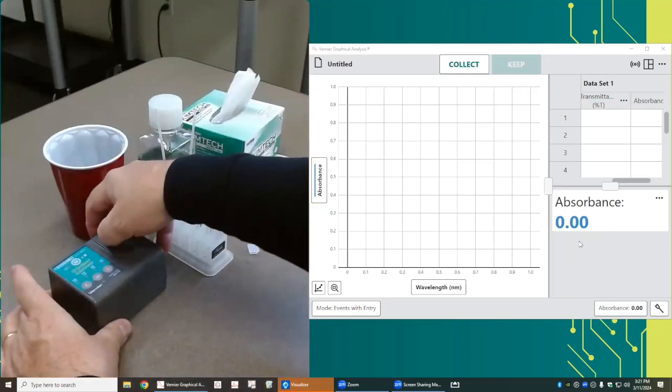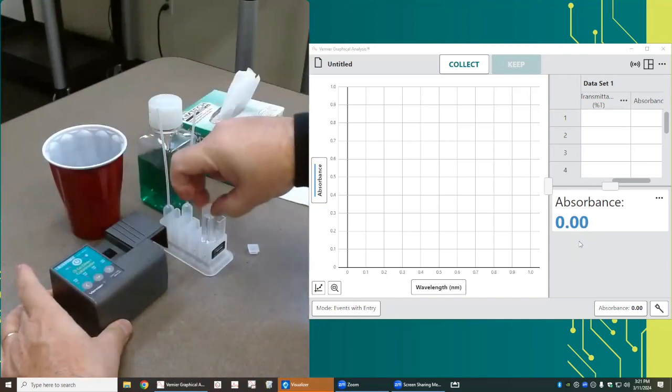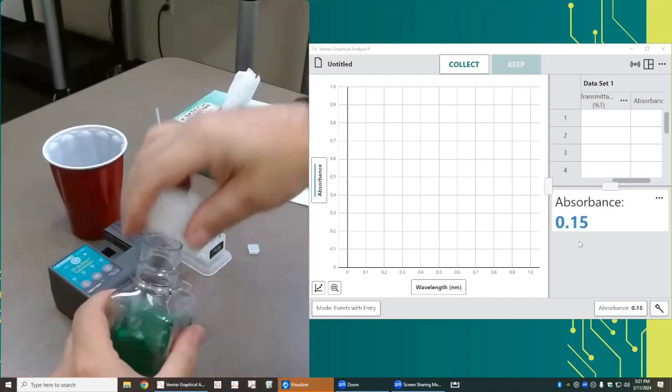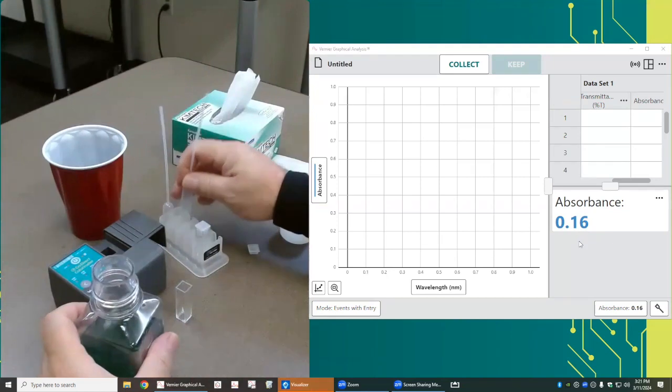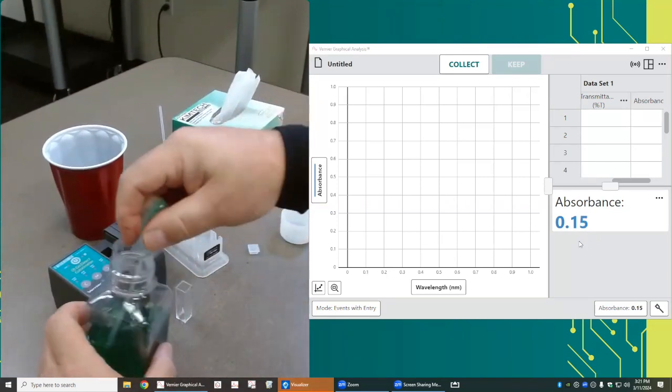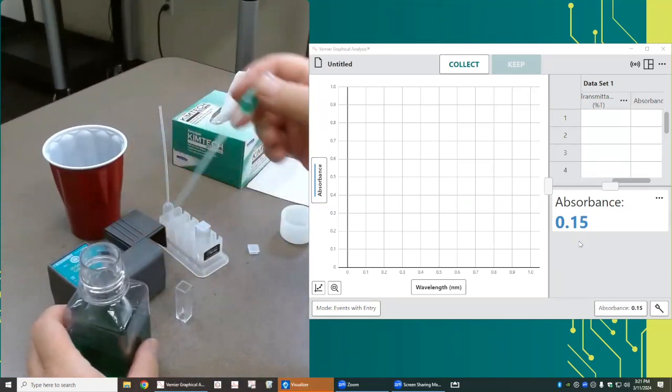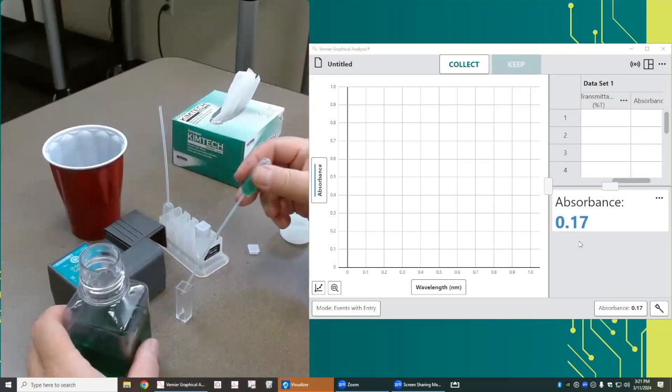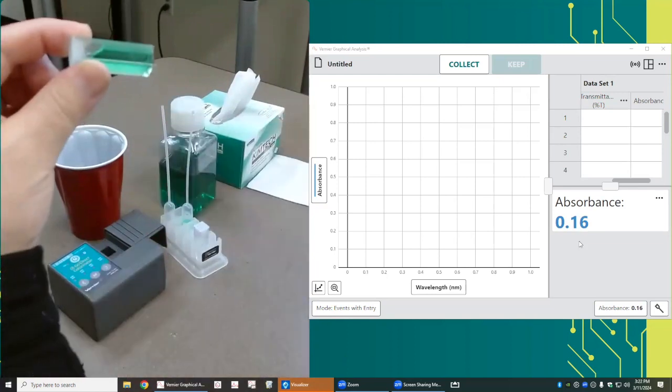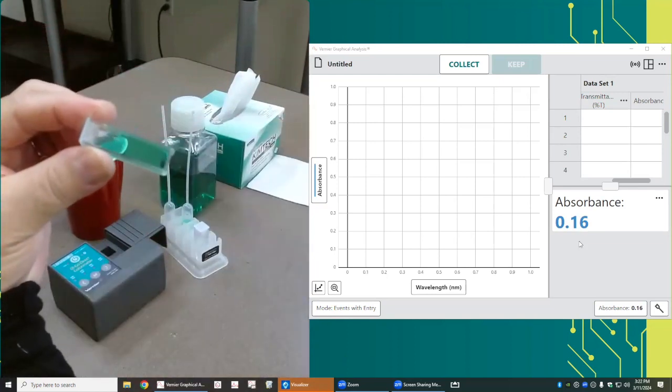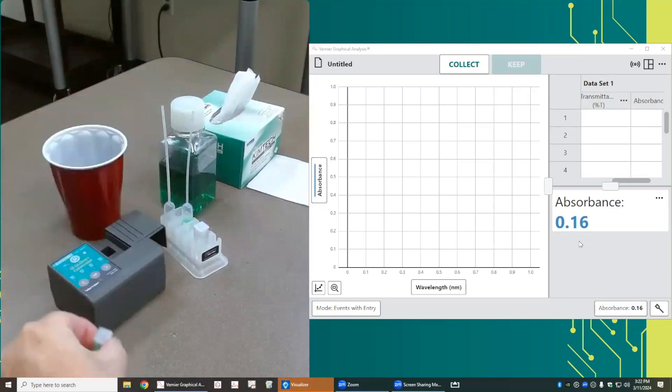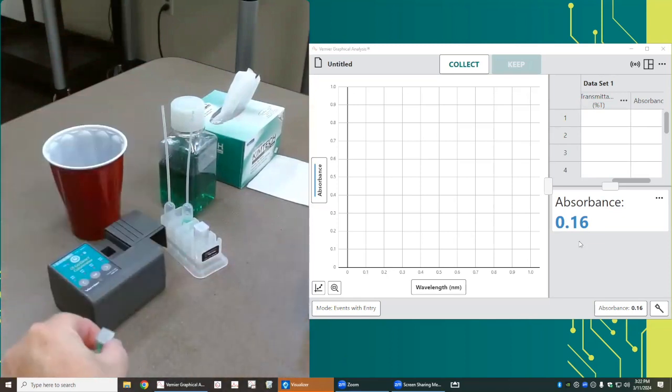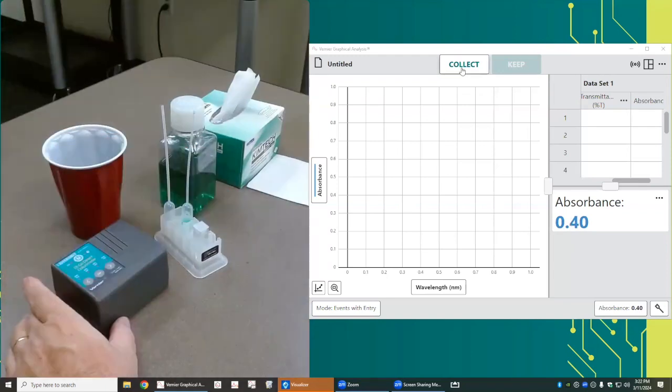I'm going to take that cuvette out. I'm going to create a cuvette, so I'm going to fill that cuvette about three quarters of the way full with this green solution. Examine the cuvette and make sure there's no bubbles in there. If there are bubbles, tap the cuvette gently on the counter, and that should dislodge the bubbles.